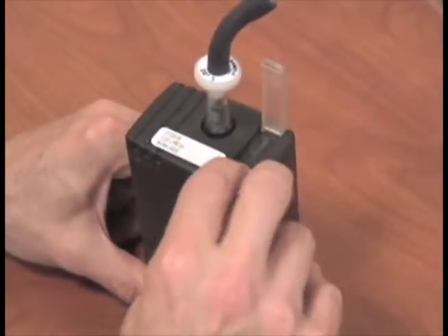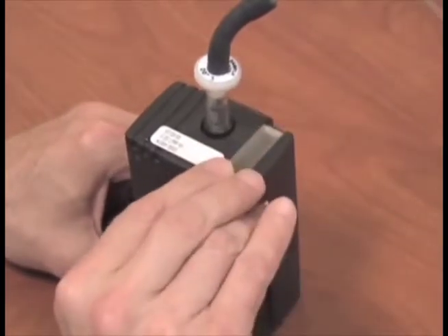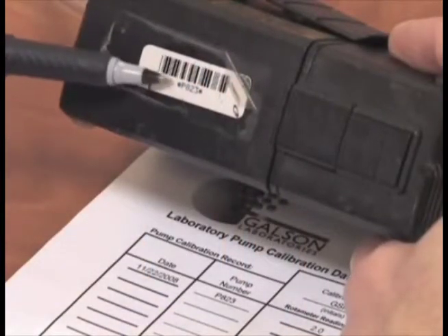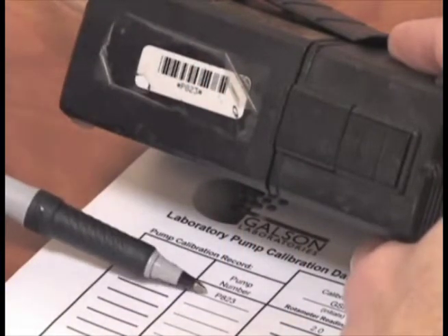Start the pumps, as they need to warm up for at least 3 minutes before you begin the calibration. Be sure to verify the pump flow rates in an area where you are not exposing the media and equipment to the contaminant, like an office setting. All pumps have the lab calibration information on the field pump data sheets provided.